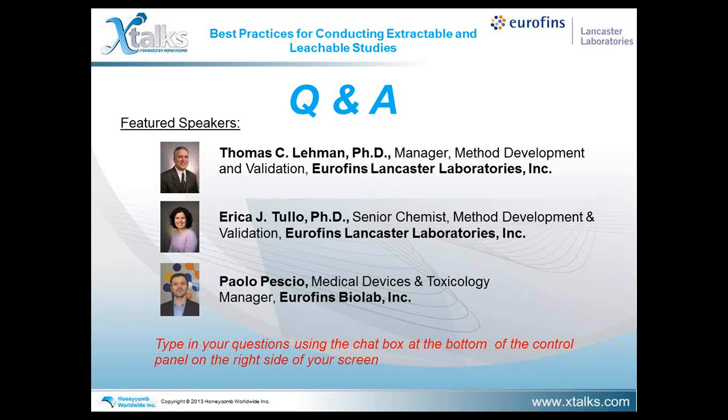In order to do that conversion from micrograms per milliliter to micrograms per centimeter squared, you're going to need to know the surface area of the component that was extracted and also the amount of solvent that was used to cover that component. Generally, we use approximately 60 square centimeters per 20 mL of solvent. So you would take the micrograms per milliliter and multiply it by the amount of solvent, which in this case is 20, and then divide that number by 60 square centimeters to get a microgram per centimeter squared value.